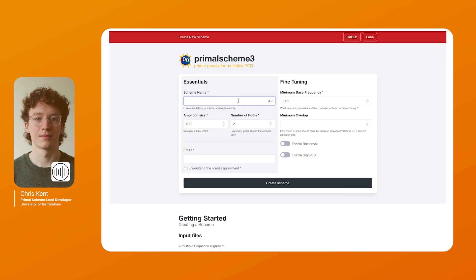When you start the website this is the page to be greeted with and you need to enter a nice scheme name. You want to pick your amplicon size depending on the sequencing technology that you are using and the sensitivity that you want. Typically 400 base pair schemes are very good for wastewater where you have very complex samples but larger schemes such as 1000 are better for handling high levels of diversity, especially if you have quite strong samples like clinical isolates.